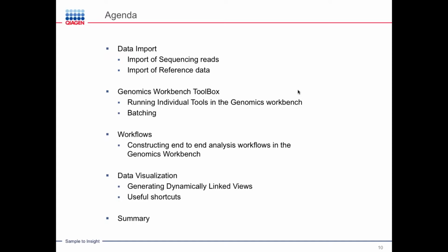Then we're going to focus on constructing end-to-end workflows. That is a very powerful feature of the Workbench, which allows you to construct end-to-end analysis workflows. And then we're going to see data visualization, like how to create dynamically linked views, as you just saw, so that you have one single genomic view of all your data, which makes analysis much easier.